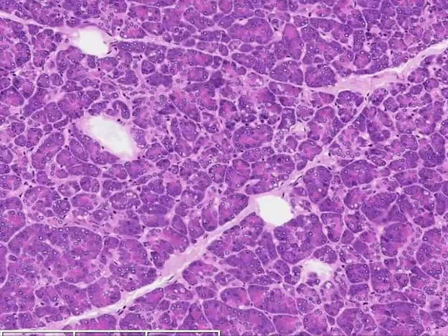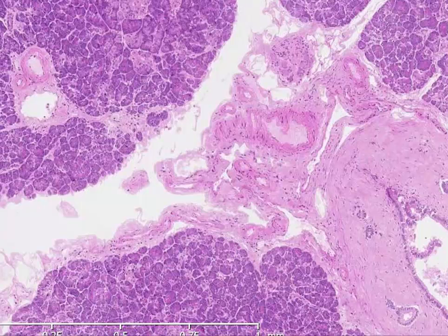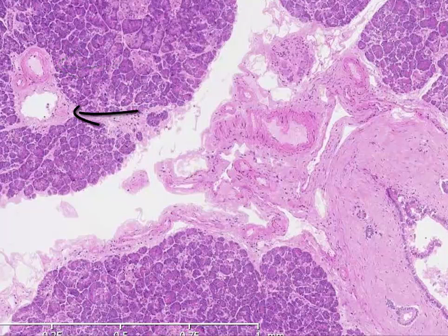The pancreas contains a large amount of connective tissue. The septae divide lobes of the pancreas. We see arteries, veins, and capillaries throughout the connective tissue. Here is an artery and vein and more connective tissue in the center of the image.